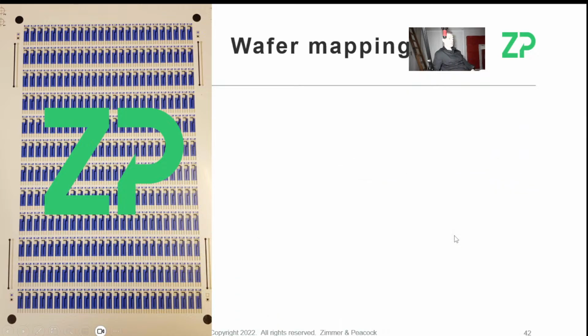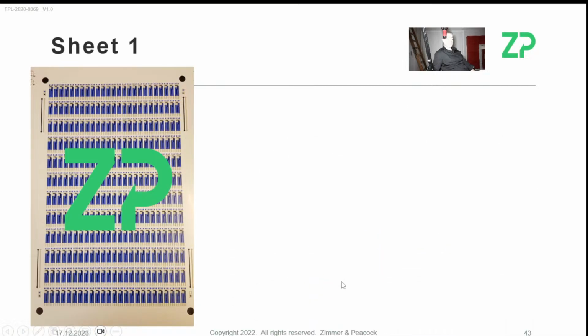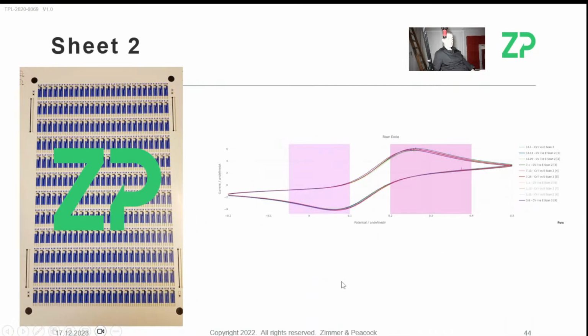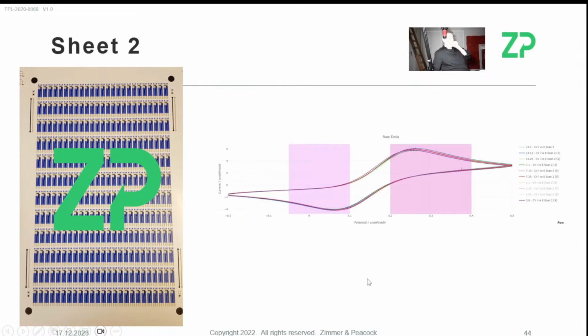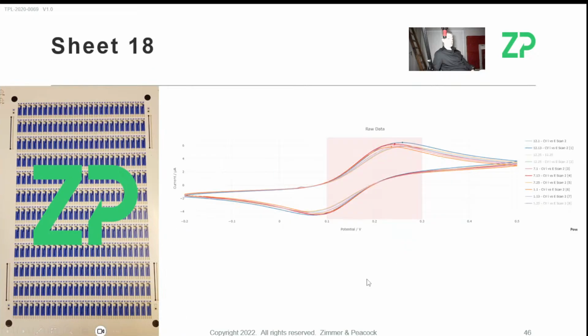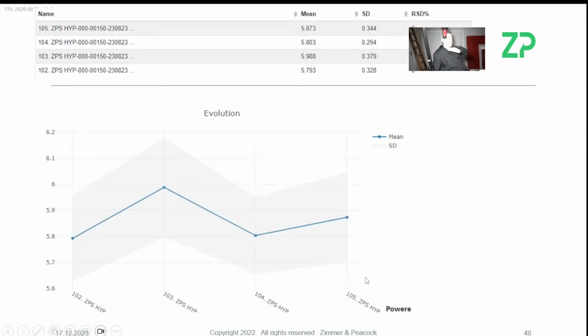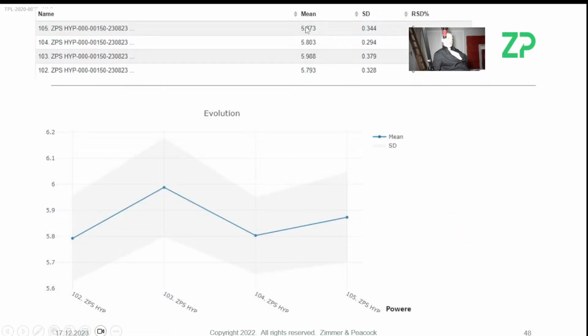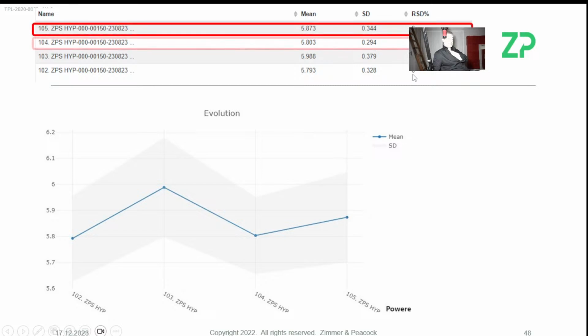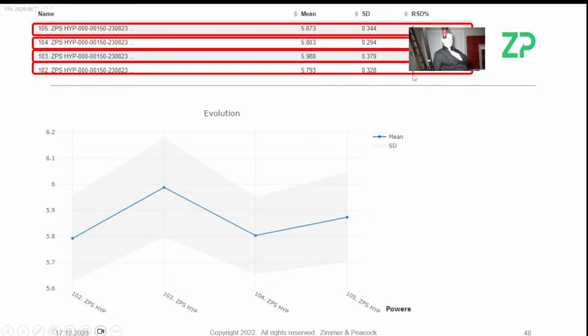But wafer mapping says, here's 300 electrodes in a sheet, and we'll test them by voltammetry to make sure that they're reproducible. For example, we would reject this sheet, but we would accept this sheet, and this sheet, and this sheet, and we would produce something called KPIs, key performance indicators. We would test a number of sensors on a sheet. Then we would look at the mean, the standard deviation, and the relative standard deviation, and actually then pass these sheets, and if the sheets pass, then we'll pass the batch. And by the way, we do reject batches.